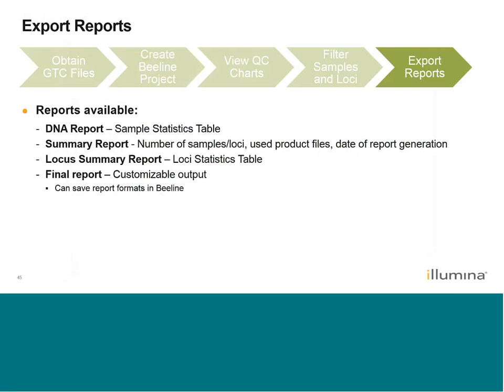We've created our project, looked at QC metrics, and filtered what we didn't want in our final report. Now we're ready to generate a report. There are a couple of report formats readily available: a DNA report (output from the sample statistics table), a summary report (all experiment details), a loci summary report (all information in the SNP/loci statistics table), and a final report — a customizable output where you can include genotype calls in a specific strand format, chromosome and location, probe sequence, and more. You can save those report formats in Beeline. To create a report, go to Reports in Beeline, select which report types you want, and there's also an option to save favorite formats.